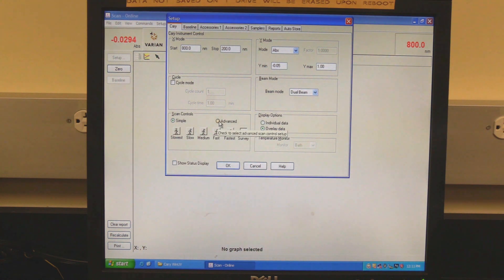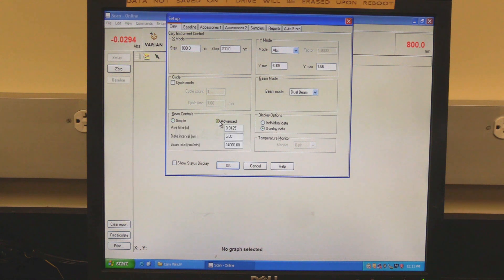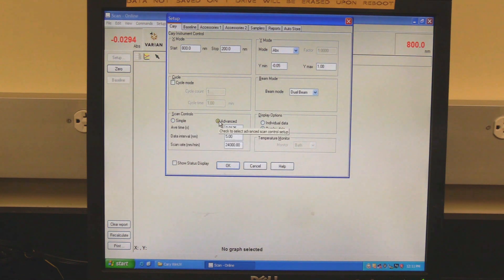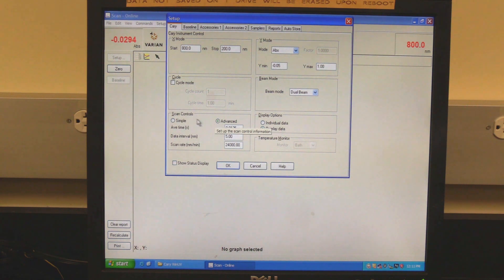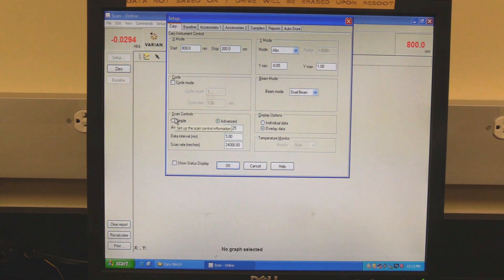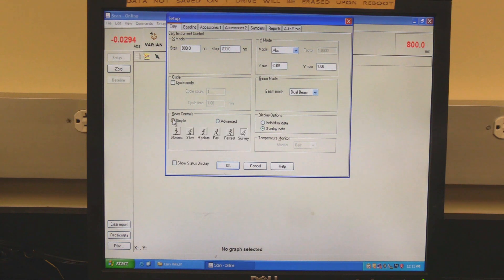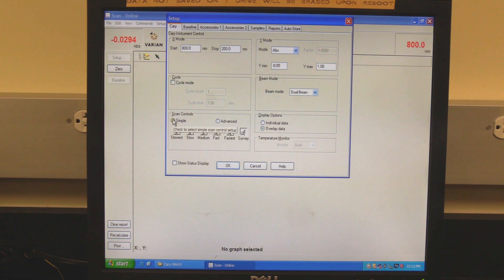Simple or advanced controls can be selected. If simple is selected, choose one of the speed modes. If advanced is selected, set the average time and data interval. Scan rate will automatically be calculated. In display options, set whether to display data individually or overlay.